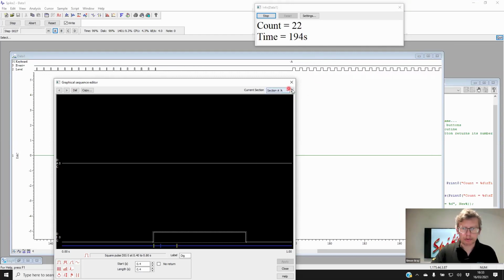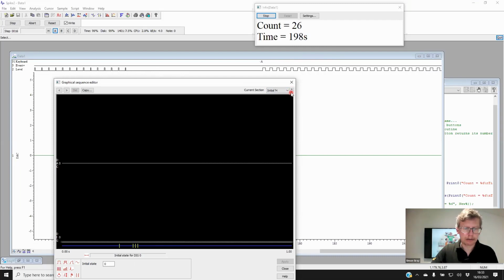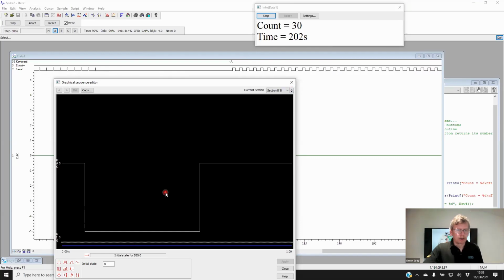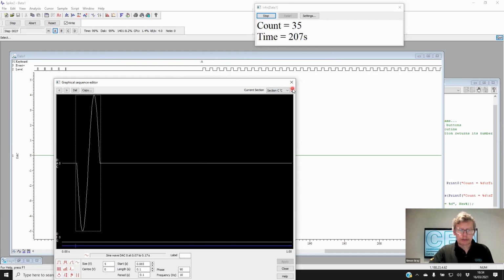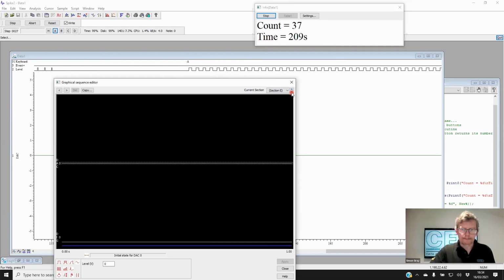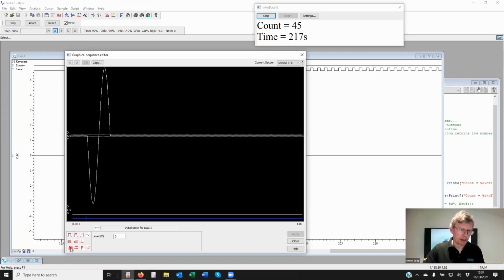Right, now, what else have we got here? Let's go to Halt. Section B, C. Looking at C here. Now, from the bottom of the palette, I've pulled up an icon. I'll put another one over here.